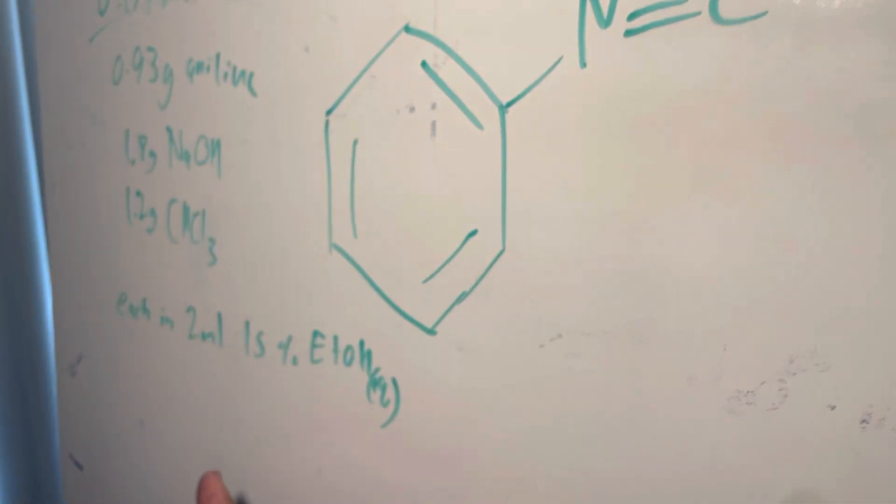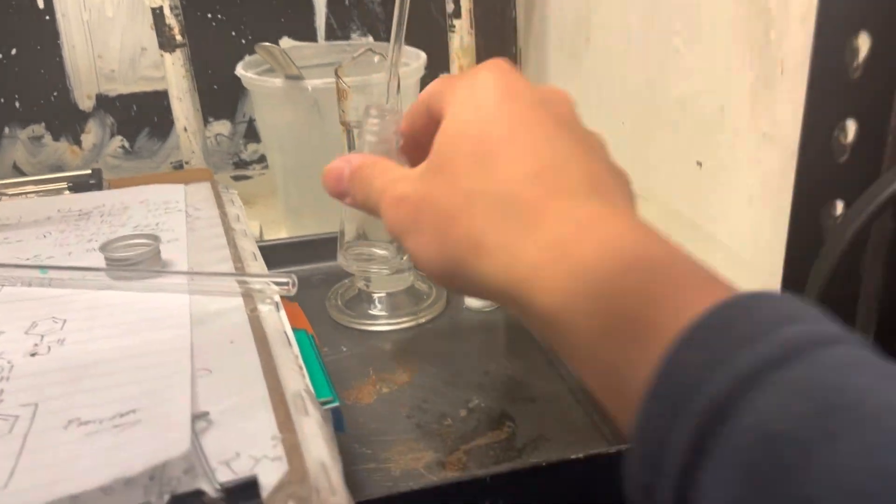We're gonna use 0.93 grams of aniline, 1.8 grams of sodium hydroxide, and 1.2 grams of chloroform.